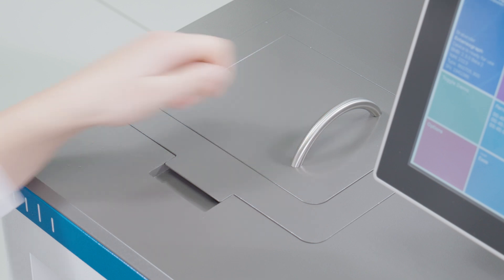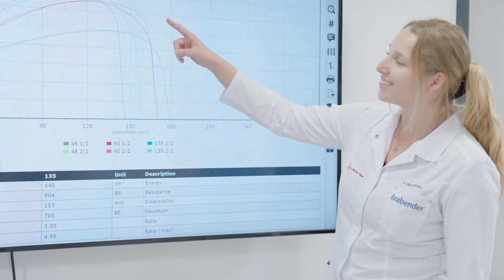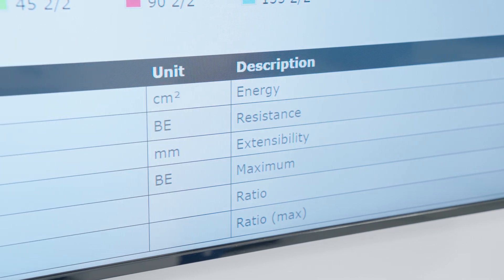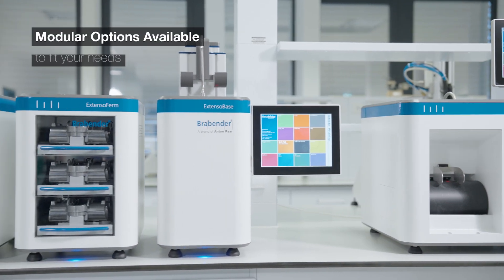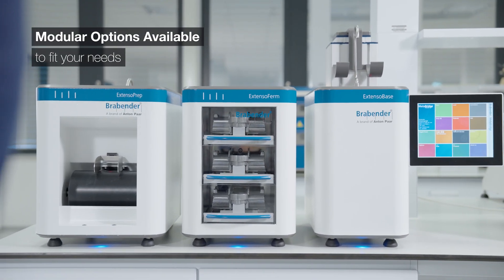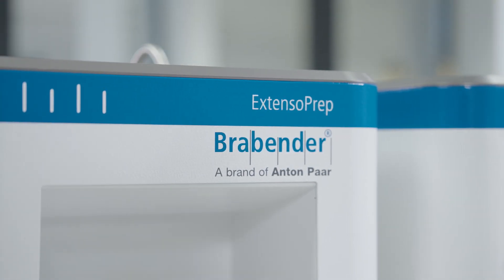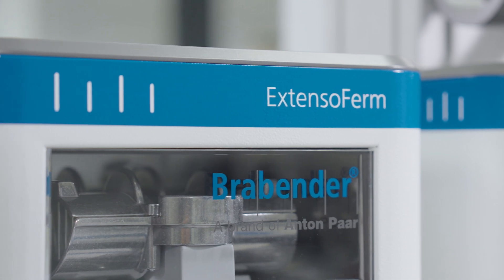The Extensograph is the only instrument on the market meeting national and international standards for stretching, extensibility, and processing — the universal language of dough analysis, in Brabender and Extensograph units. The new Extensograph is as unique as your bakery. With its modular option, it's up to you how to configure your instrument, whether you're looking to optimize space or modernize older Extensograph devices.